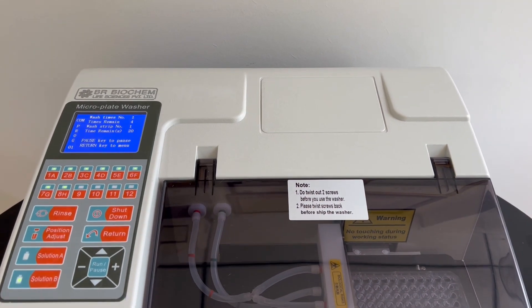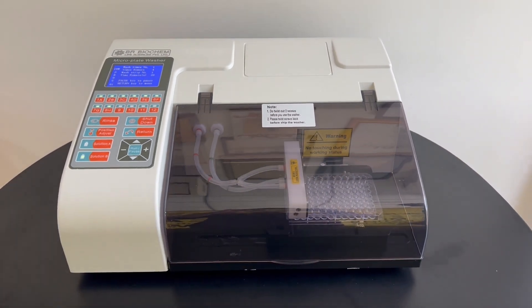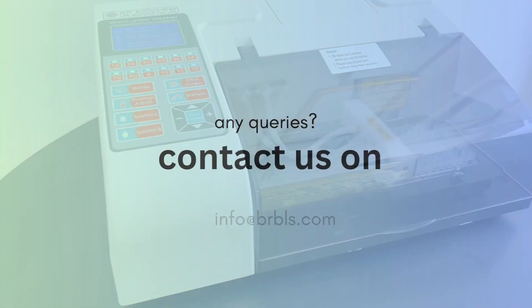Experience the power of our micro plate washer and unlock new possibilities in your research.